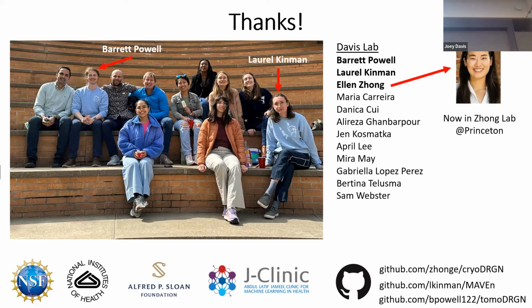So I think people are starting to think about cryo-EM as a method to screen for where things bind. I'm not in pharma, but more and more people in the groups of pharma are starting to think about this. It depends a little bit on who's running the group and what their biases are, and I think that's a testament that cryo-EM has caught up. I would say if you have proteins that crystallize and you can soak, that still seems to me like it's going to be faster to just go through a compound screen. If we're getting close.